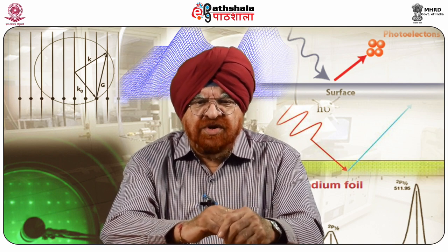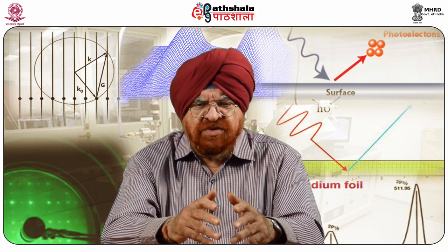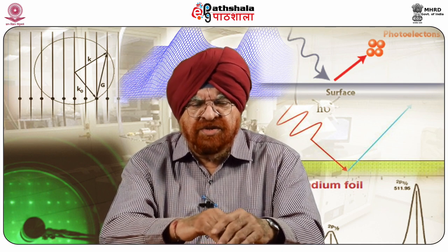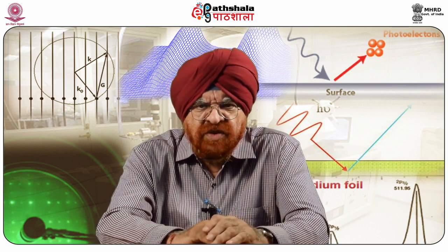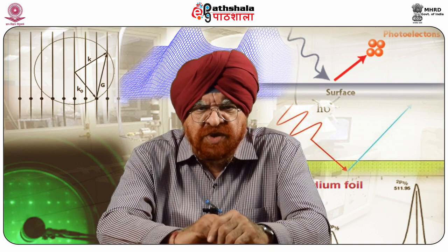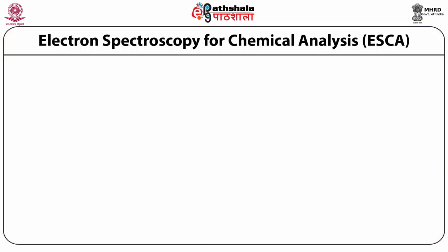The long path length for detection requires such low pressures. Since hydrogen is not detected, these atomic percentages exclude hydrogen because it is not detectable under this technique. To count the number of electrons during the acquisition of a spectrum with a minimum of error, XPS detectors must be operated under ultra-high vacuum, because electron counting detectors in XPS instruments are typically 1 meter away from the material irradiated with X-rays.